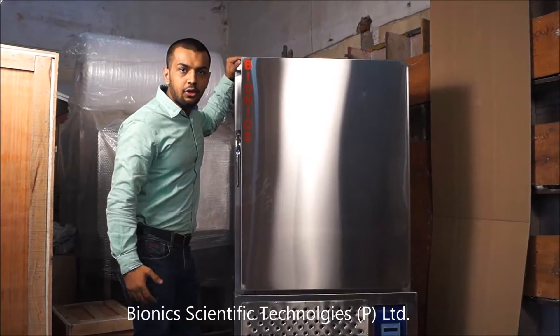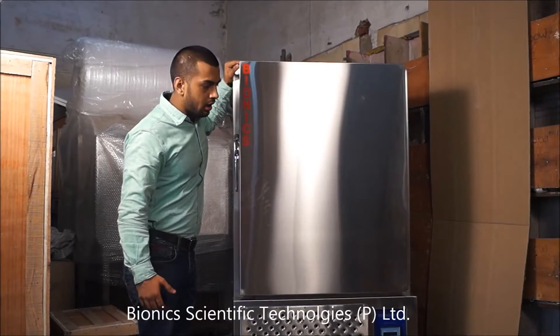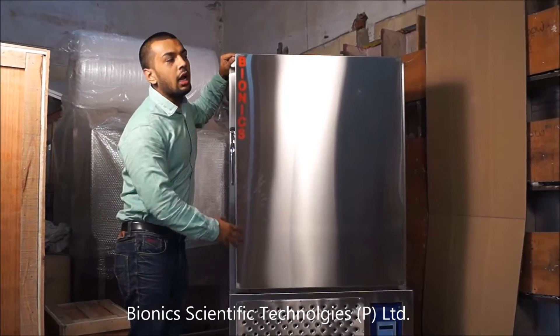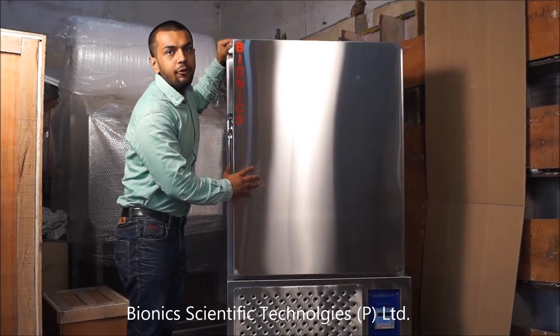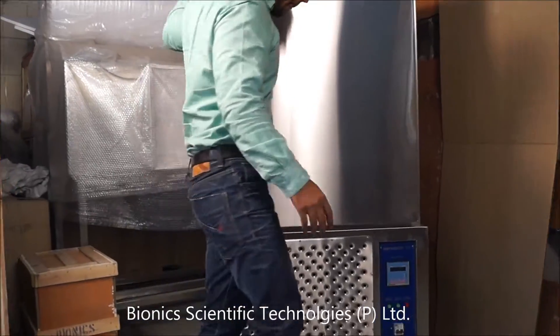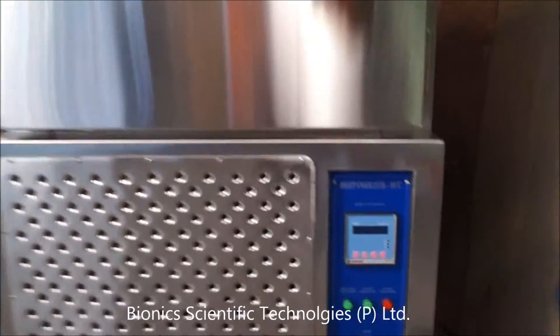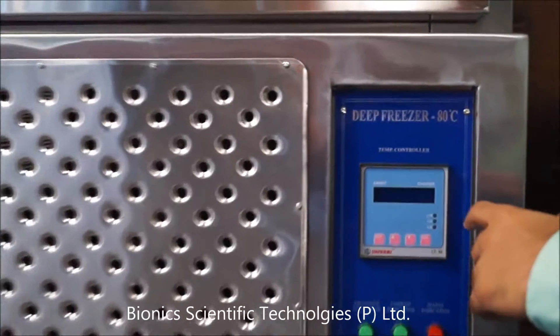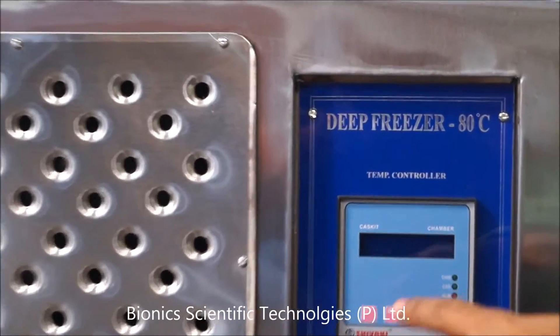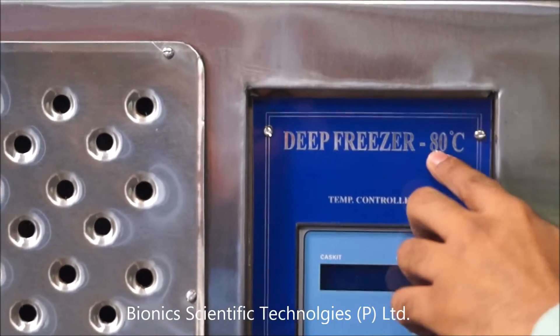Welcome to Bionics Scientific Technologies Private Limited. Here we are introducing our laboratory deep freezer. The maximum temperature of this deep freezer is minus 80 degrees Celsius.